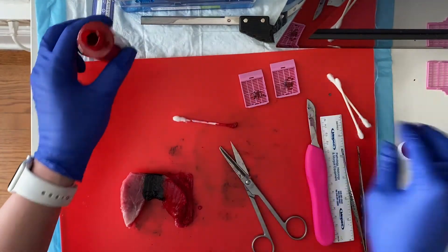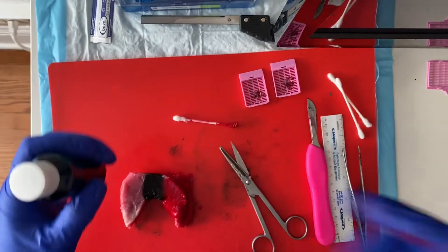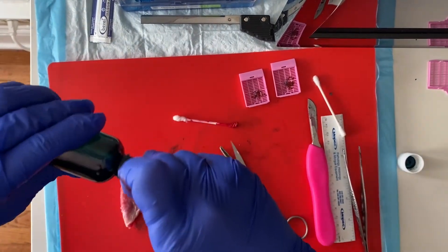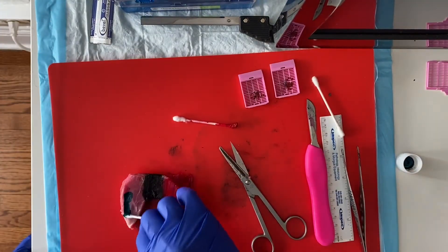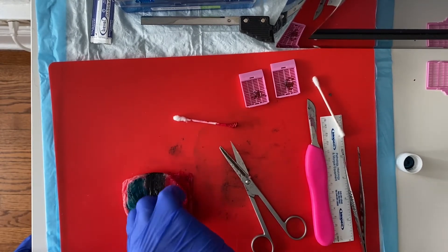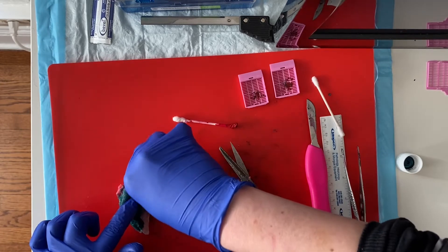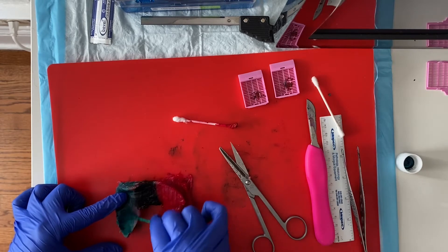Then I'm going to do my left lobe green. Green ink is the really stubborn one — I've got to really get it in there. This is my anterior side. I'm going to ink the entire thing all the way around 360 degrees, making sure that my green ink matches up with my black ink.